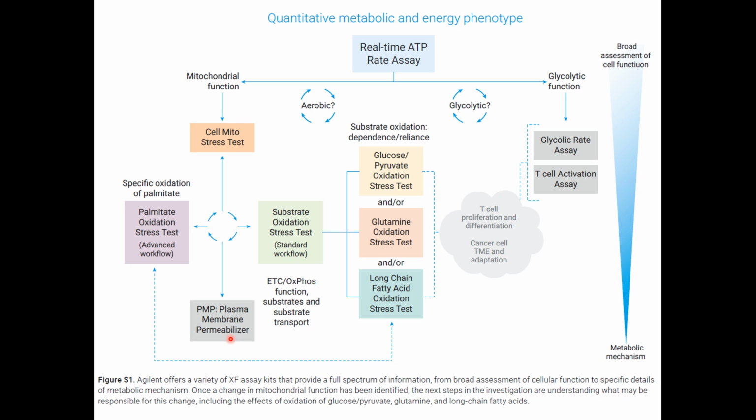It will penetrate the cell membrane, but not the mitochondria membrane. So you can add the electron supplier of each complex, because these are very big molecules. Then you can do a very good experiment design of isolated mitochondria.